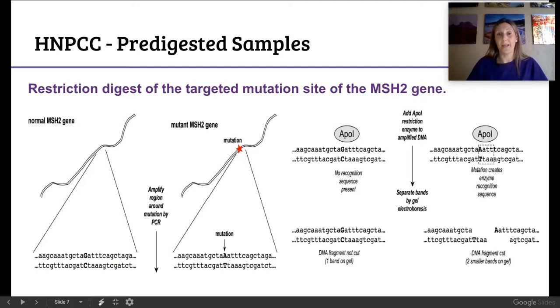So this is a great lab to introduce biotechnology into your classroom, because this could be something that you talk about, but the kids aren't actually doing this quite yet, but they will do the step of gel electrophoresis. And then in later labs throughout the year, you can start to work in certain restriction enzyme labs, and then also labs that incorporate the process of PCR. So for me personally, this is the first gel electrophoresis lab of 5 that I do in my AP Biology class.